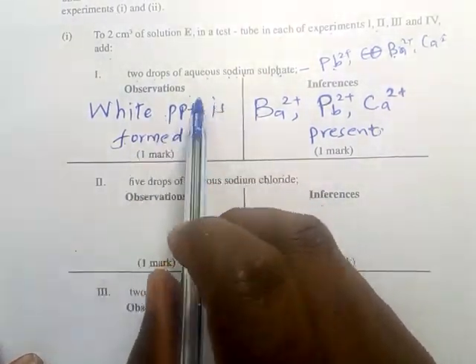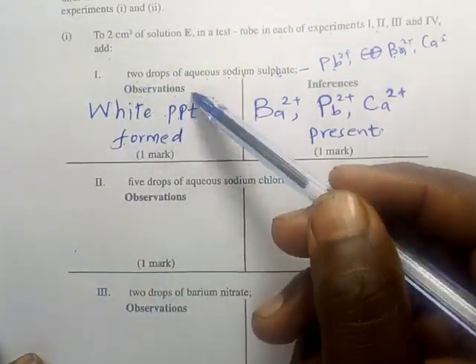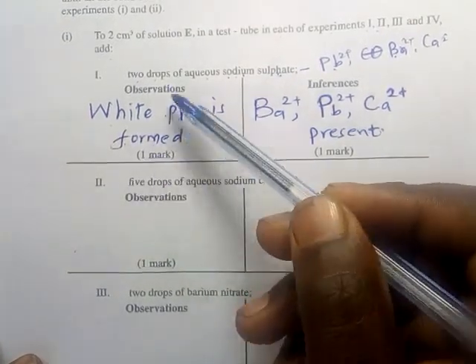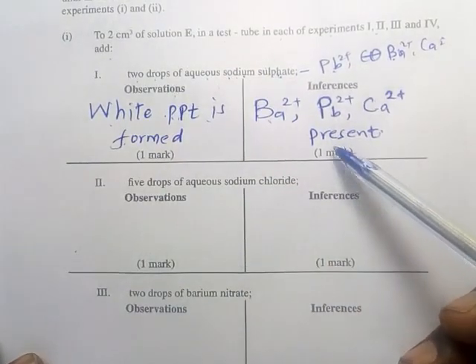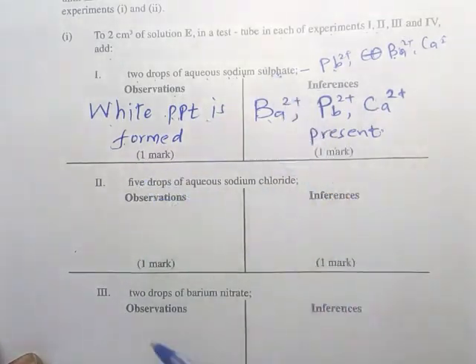The reason why I'm emphasizing qualitative analysis is that this year, for example, you can be given sodium sulfate and there will be no white PPT. If there is no white PPT and you are using sodium sulfate, you will write this one absent. There's nothing much that will change in this.